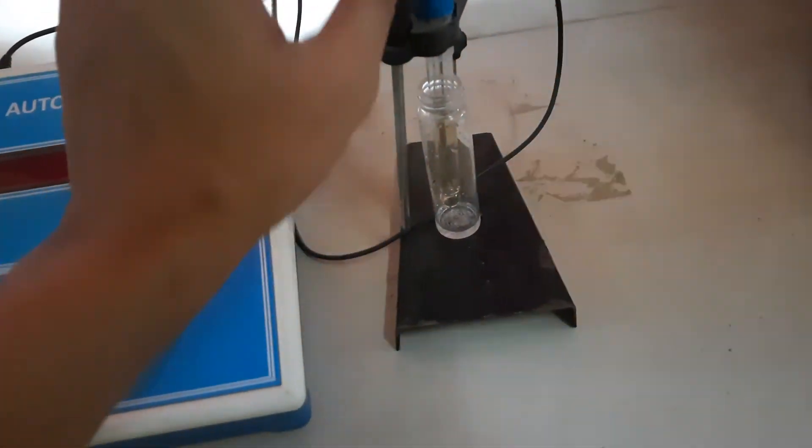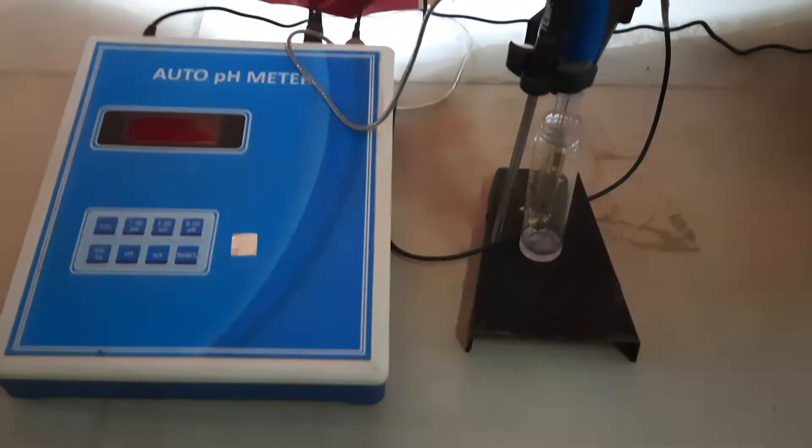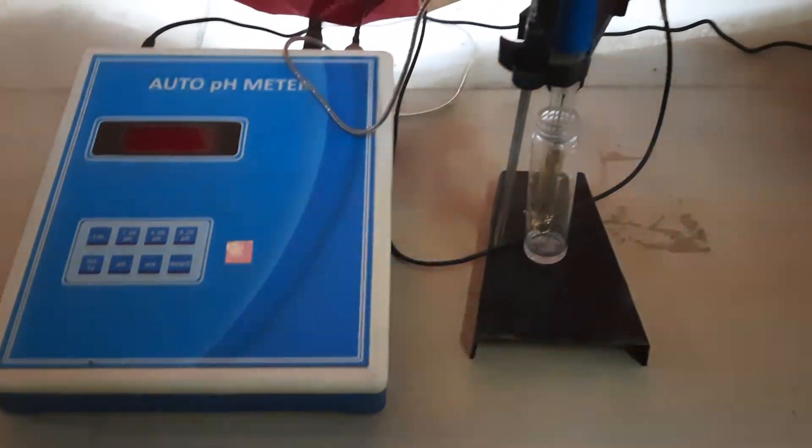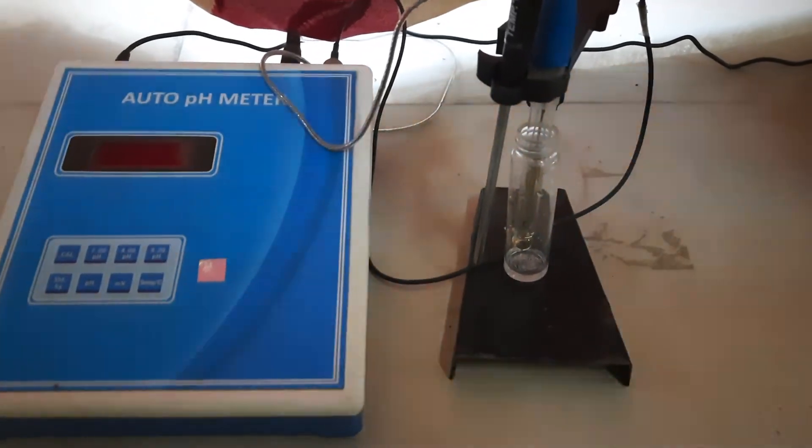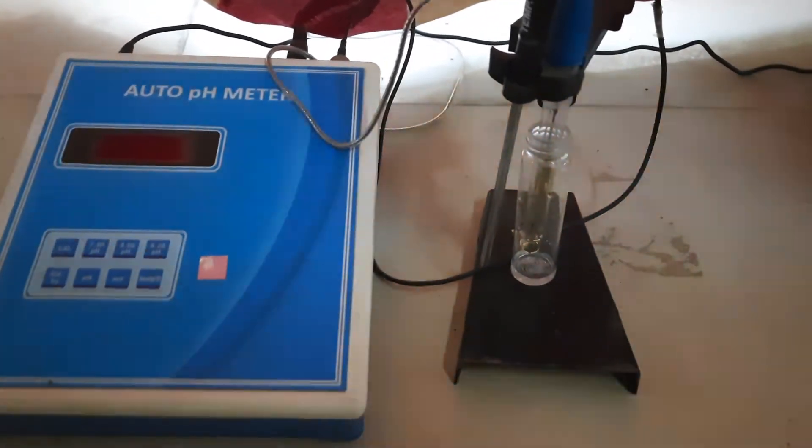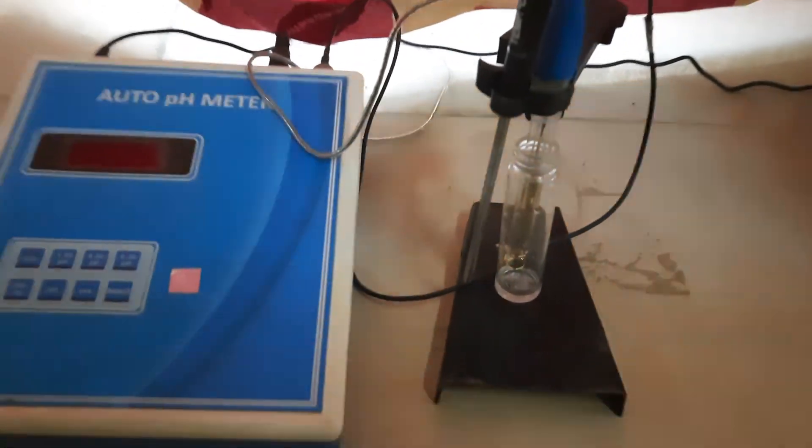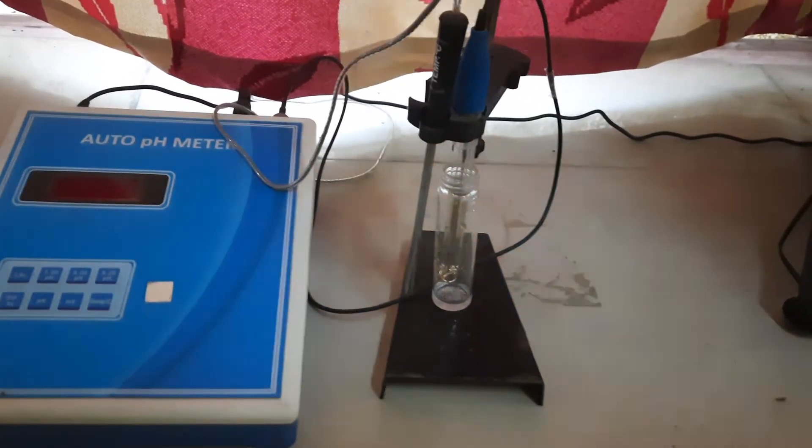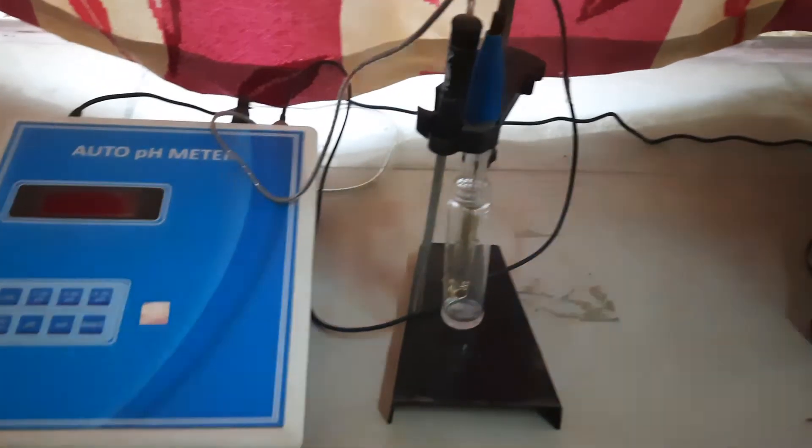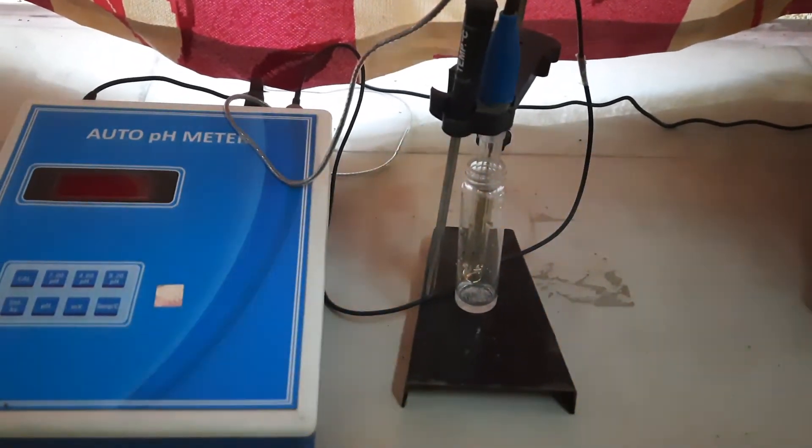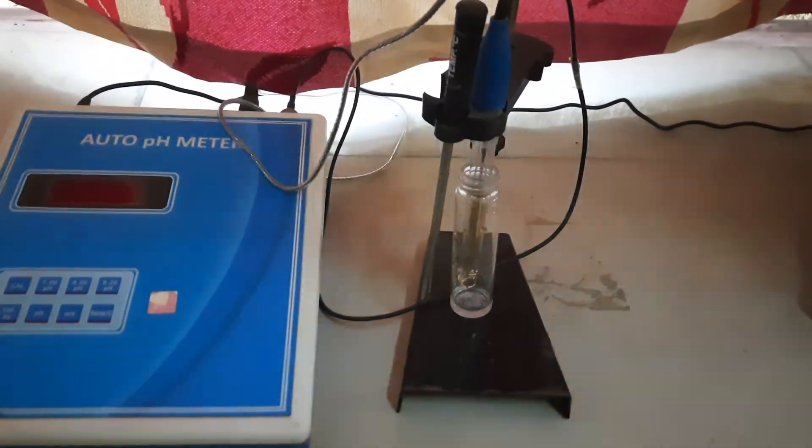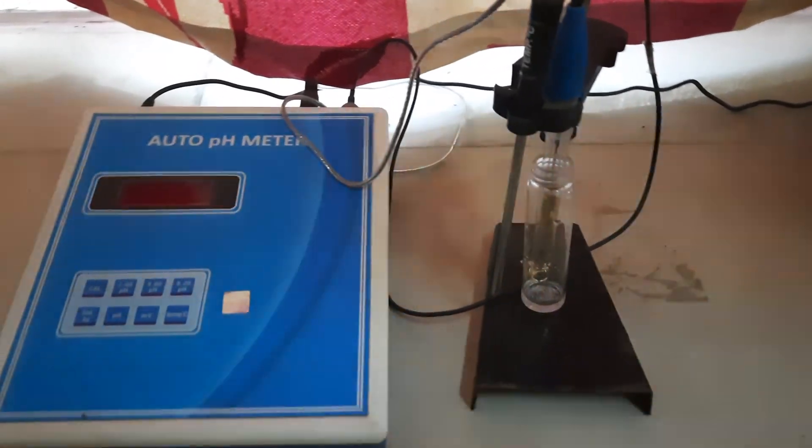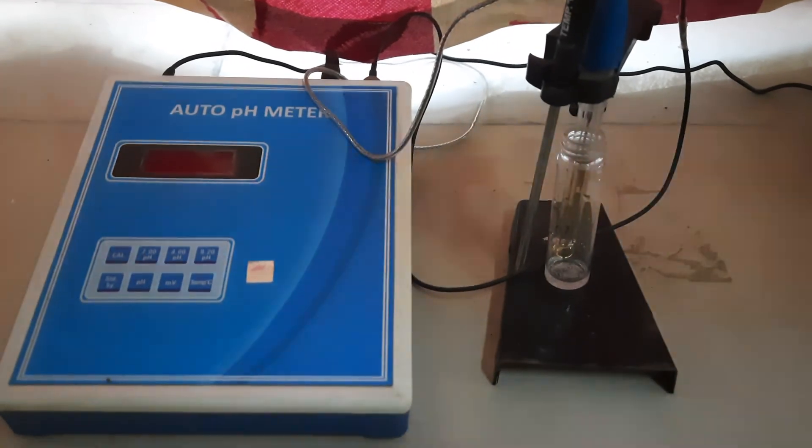This pH electrode is generally made up of glass. The electrode we have right now uses mercury-mercury chloride; sometimes we use silver-silver chloride also. This is the pH meter by which we are going to measure the pH of the buffer solutions we have prepared. Thank you.